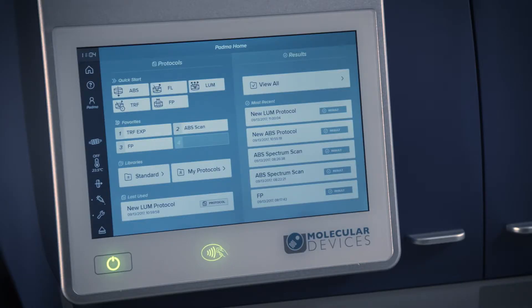If your reader does not have the injectors installed, the injector icon will not appear and the right side of the instrument will be sealed shut. To order the injector system with Smart Inject for your ID reader, please call your local sales representative.